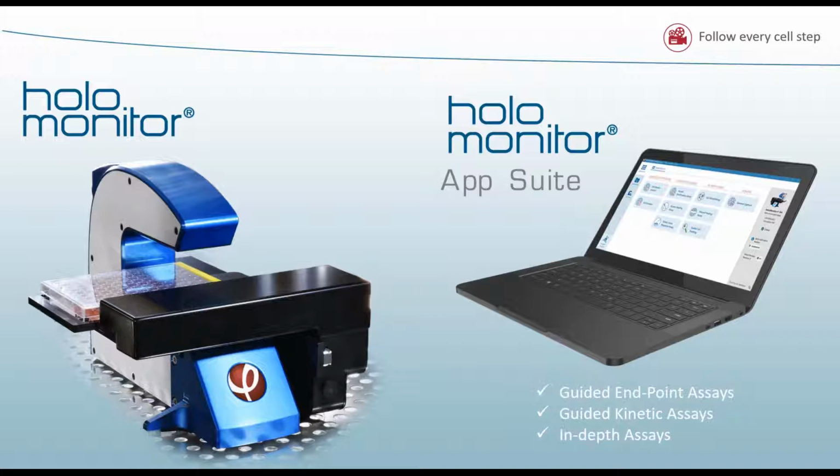To be able to analyze everything, we have the software, the app suite, that comes with the HoloMonitor. You need both of them to make the analysis. And the software is divided into 3 parts. We have the guided endpoint assays. There you just get the result like the cell size or the cell number, just one time point. For cell movement, that's not really useful. But we also have the guided kinetic assays, where you follow the cells over time, and it's all set up.